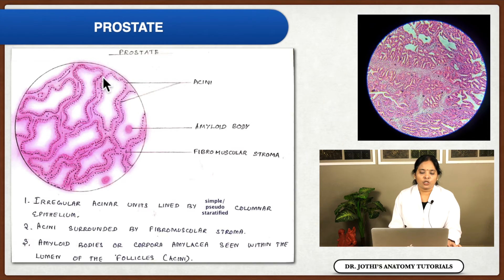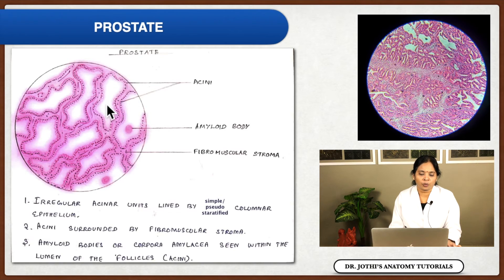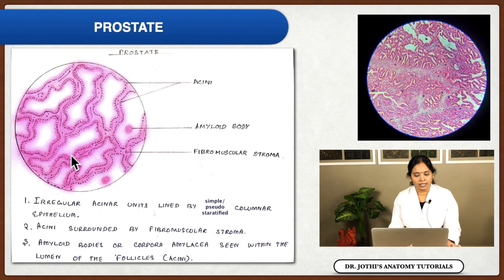The parenchyma of the prostate is a tubuloalveolar gland. The tubular glands have a mucosa thrown into folds, and the acinar units are rounded structures lined by columnar cells. From the capsule, septa enter the gland dividing it into lobules. Within the lobules, you will see glandular epithelium thrown into folds. The glandular epithelium is lined by simple or pseudostratified columnar epithelium, and the stroma is fibromuscular stroma.